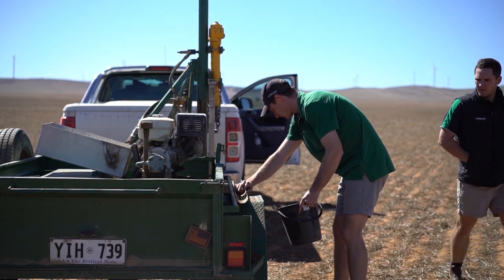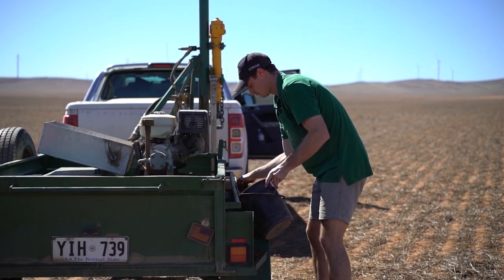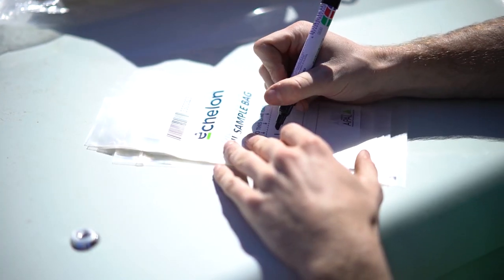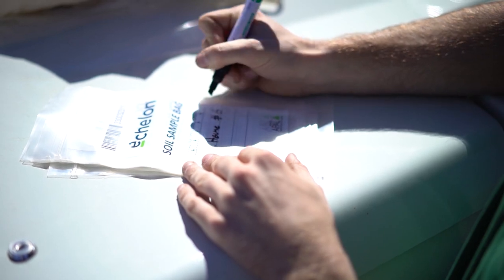We sort the sample from each depth by allocating each segment to a separate bucket. We're putting six 10 to 30 segments in one bucket. From there we're mixing and chopping up the samples the best we can. They're then put into a sample bag which is scanned into an app and sent off to the lab.